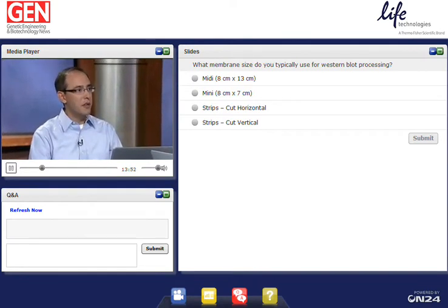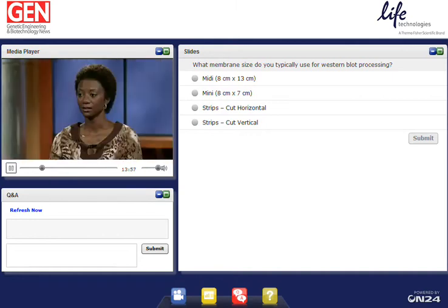And maybe while we're waiting for participants to submit their answer, Katrina, maybe you could tell us a little bit about the common formats of Western blots that you use in your lab. Well, our lab primarily uses the minis.